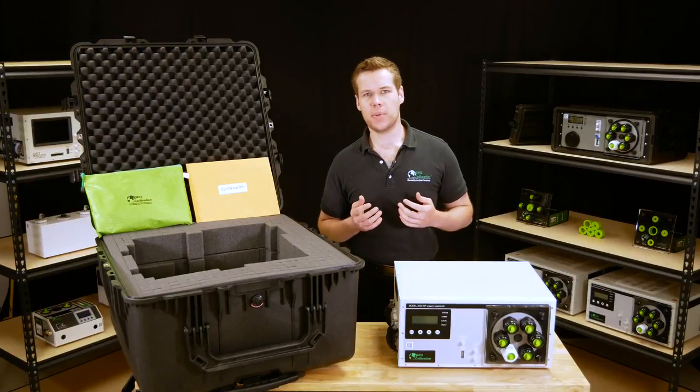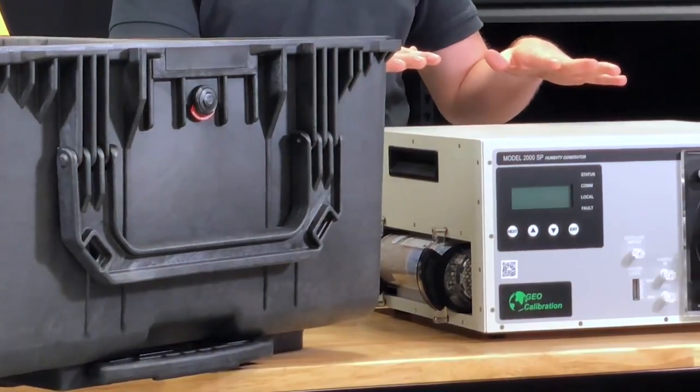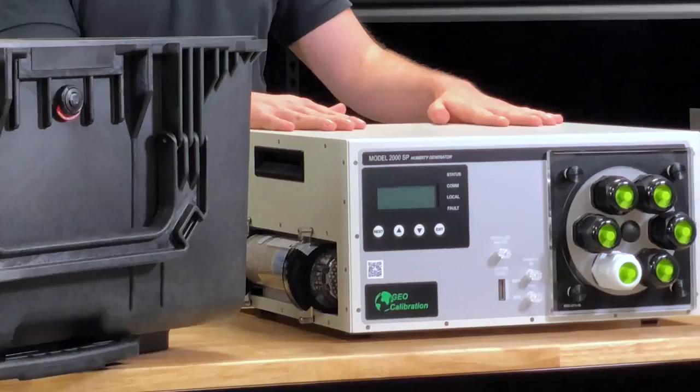Hi, this is Kyle with GeoCalibration, and today we are going to be going over a quick start tutorial for those of you who have recently purchased a Model 2000 SP humidity generator.